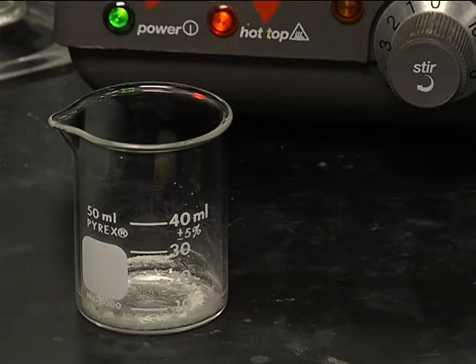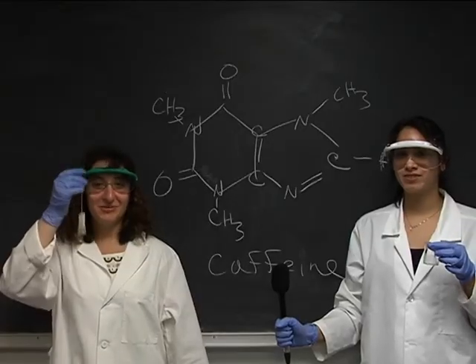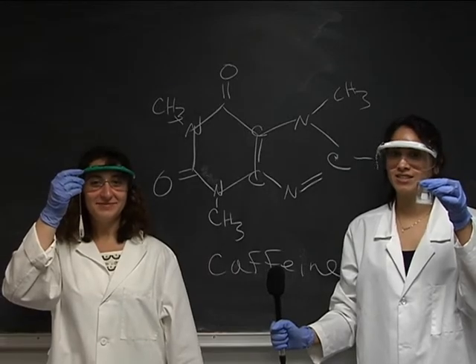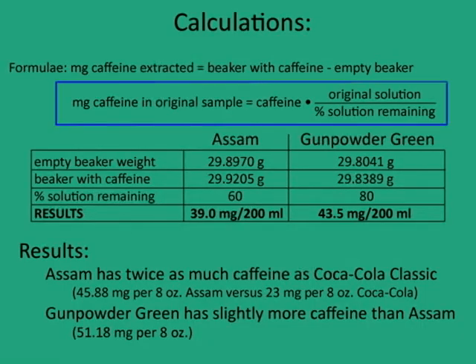See that white powder left over in the beaker? This is pure caffeine. Now that we've gone from this to this, it's time to find out just how much caffeine is in the tea. We weigh the beaker with the caffeine in it and then subtract the original weight of the beaker. The last thing we have to do is adjust the calculation because some of the methylene chloride was lost earlier when we filtered the solution.